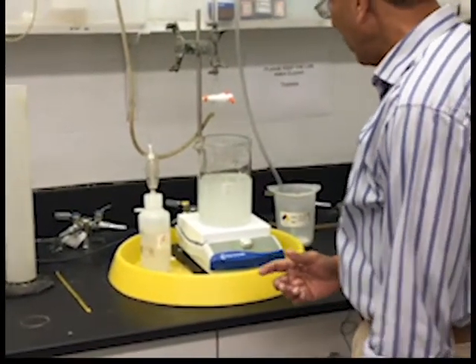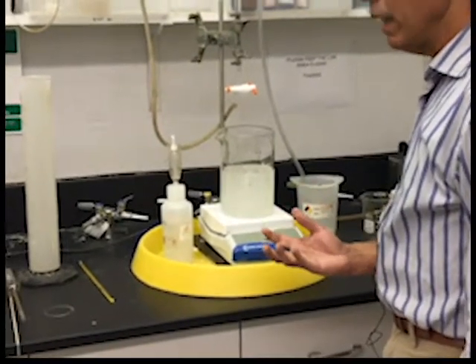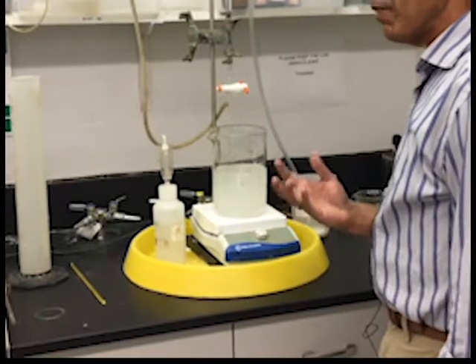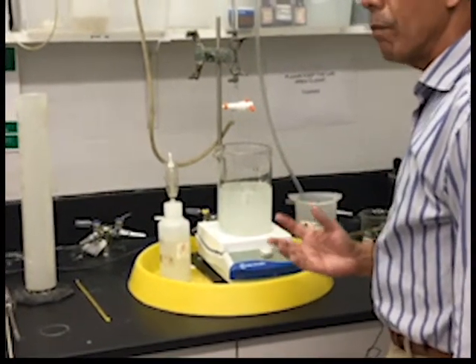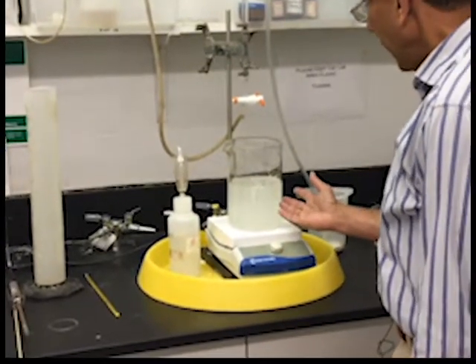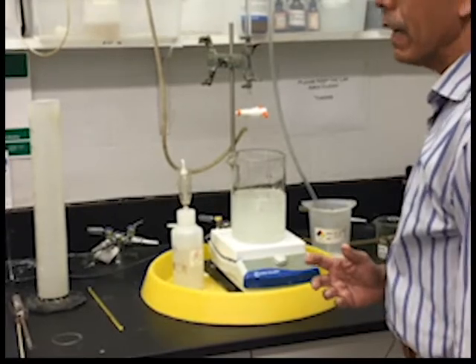The other thing I want you to notice is that the color of the fibers when I first put them in was brown, and now because the potassium permanganate, the oxidizing agent, has attacked the lignin and broken it down, you can see there is no more lignin left and the fibers have become colorless.